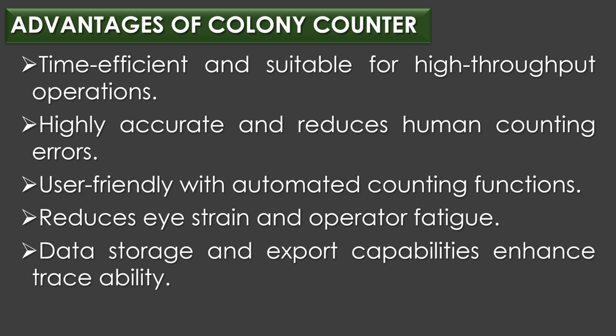Advantages of colony counter. The advantages of colony counter include time efficient and suitable for high throughput operations, highly accurate and reduces human counting errors, user friendly with automated counting functions, reduces eye strain and operator fatigue.